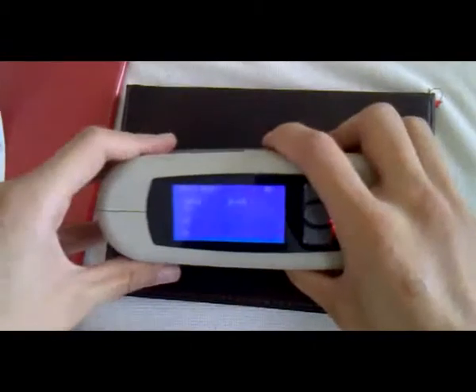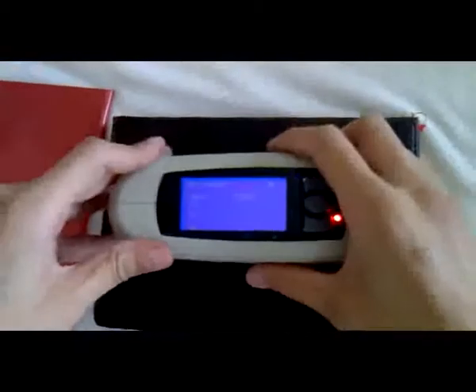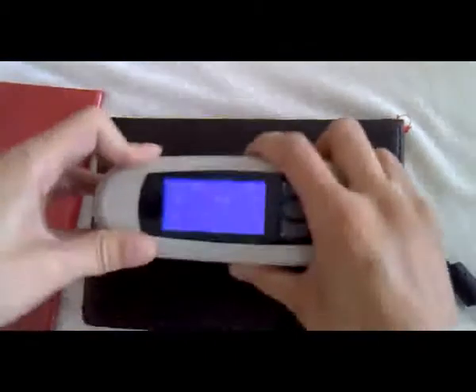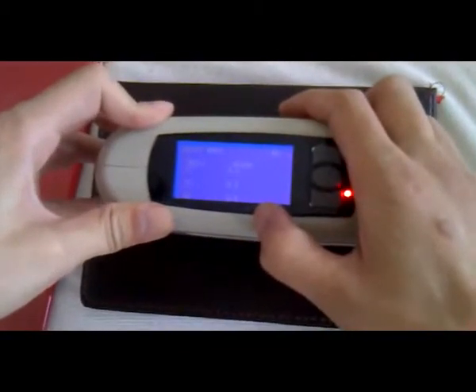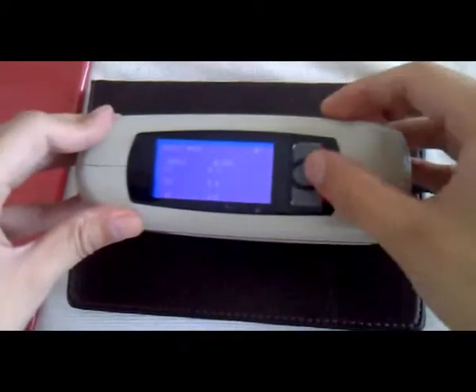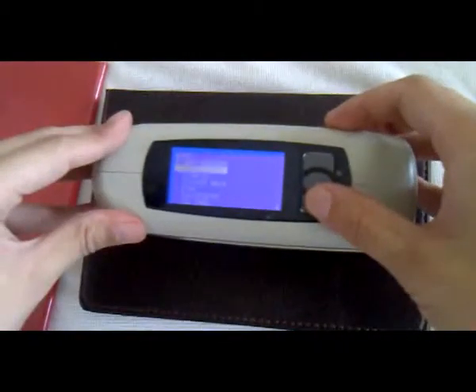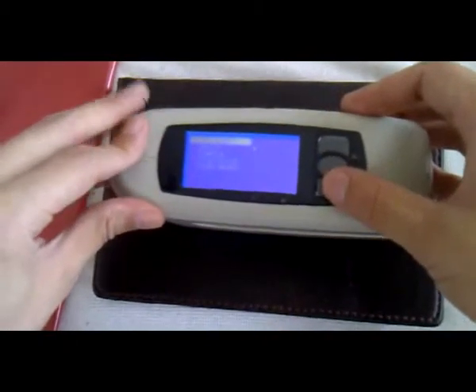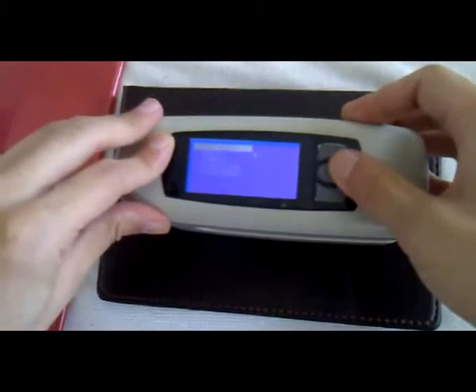If we want to test the products, put the gloss meter on your product and press the test key. It will give you the value. It has 3 angles. This instrument has 4 test modes: basic mode, simple mode, statistic mode, and continuous mode. Usually we use the basic mode.